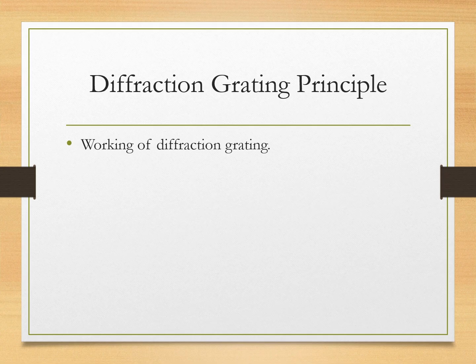A diffraction grating consists of thousands of closely spaced lines. When light hits it, it diffracts into separate wavelengths. Turning the grating allows wavelength scanning. So the wavelength is scanned while passing through the diffraction grating.